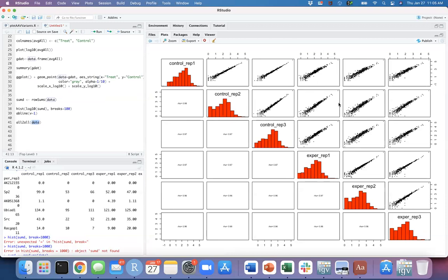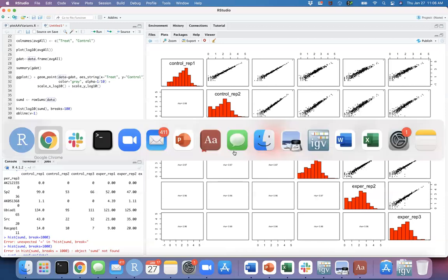But when you look at the data coming from donors, maybe the correlations are lower. It's not going to be maybe 96 if you compare cancer versus, I don't know, healthy. These are going to be everywhere. Maybe they can still be correlated, but you're going to see larger bands, larger triangles. Okay, so that's why this is an important plot.